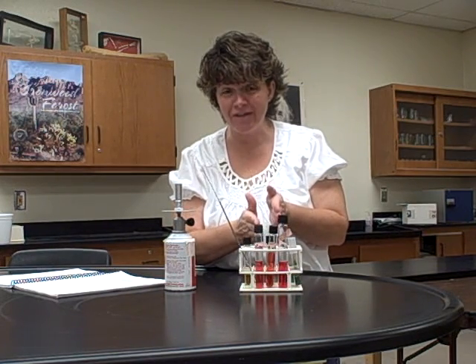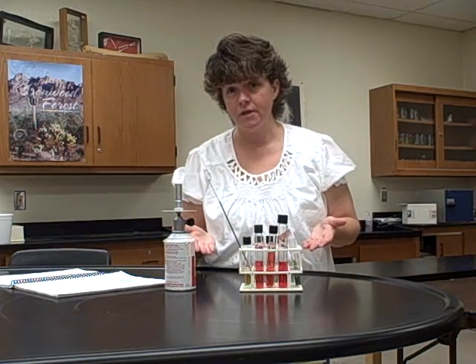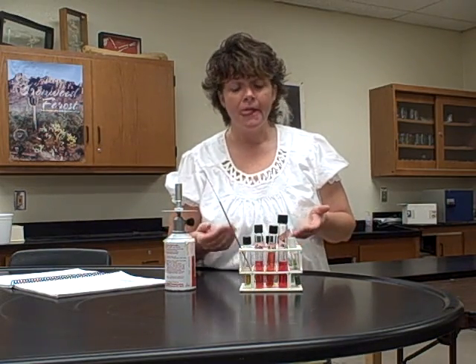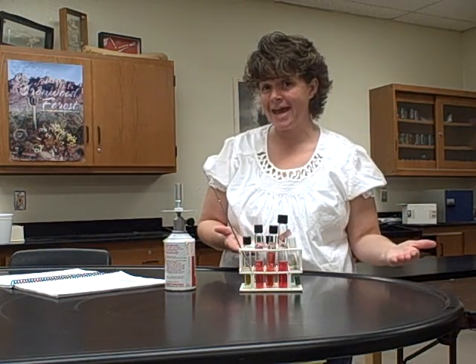Either way, we want them to start out red, because the indicator in here, the pH indicator, phenol red, is what's going to turn yellow in the presence of acid. So if your bacteria go through fermentation and they produce acid, your media will turn yellow. Okay? The other thing is sometimes when they ferment, they also produce gas.